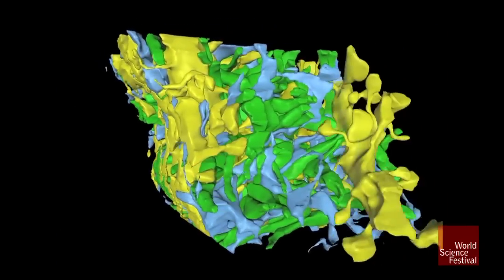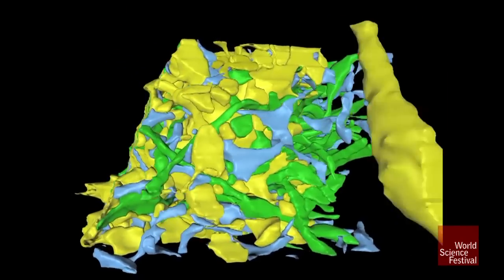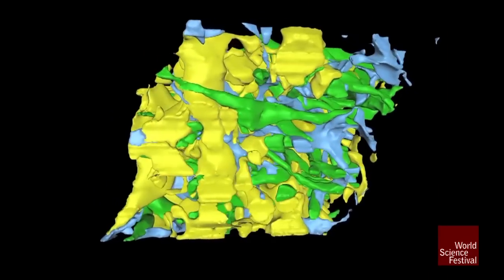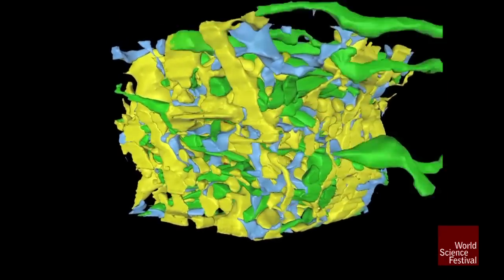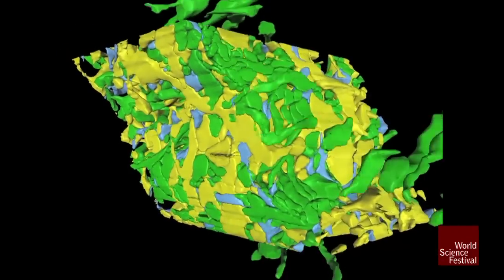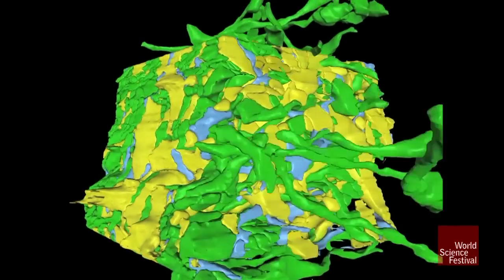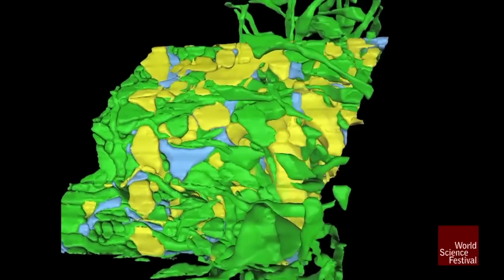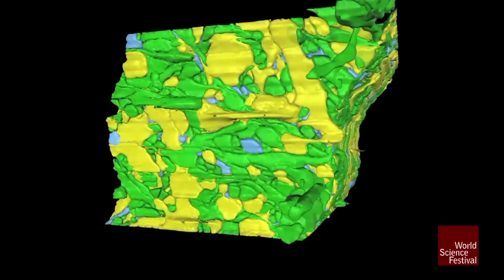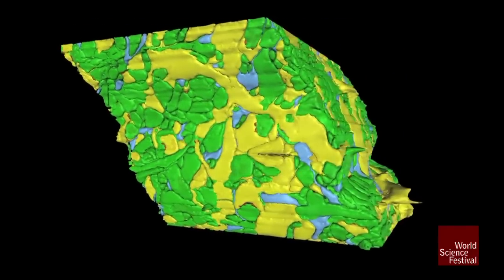So we saw a little bit of that felt work neuropil. We saw the dendrite and its axons. Now coming to join the dance are all the other dendrites that surrounded that same central dendrite that we thought was so important, right? Well, these guys are also competing for the axons. And those few axons that I showed you before only synapsed with that central dendrite. Now, the rest of these axons were within reach, but didn't make it. They didn't make a synapse with the central one, but they're synapsing with these other dendrites in this volume. And so it's this kind of knowledge that we need to have before we can really have a realistic idea of exactly how your brain is working.